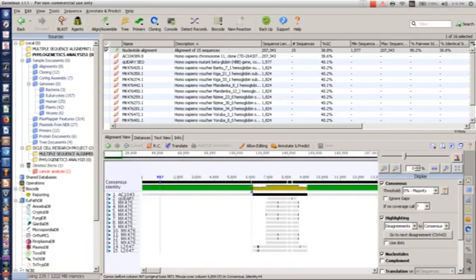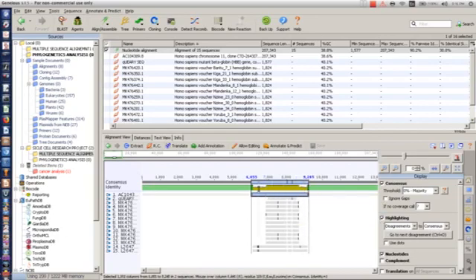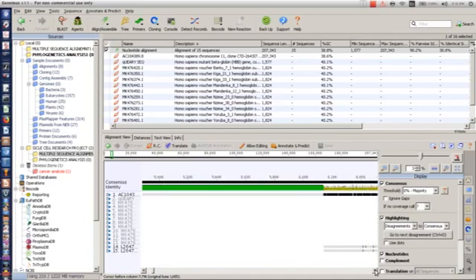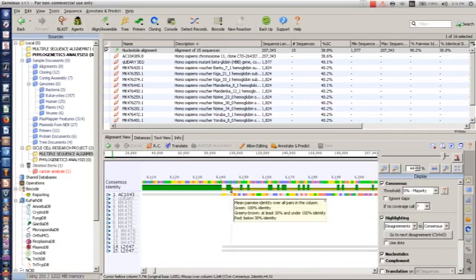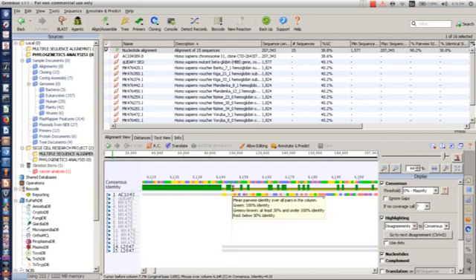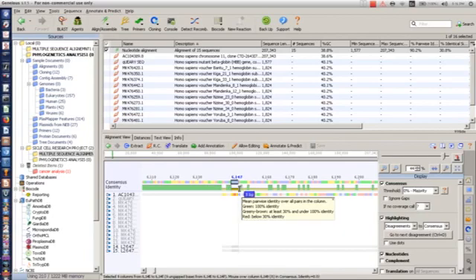But this is actually our region of interest, as you can see. Just this place, this is where I like it. So all you need to do is zoom, so we understand what we are really working on. As you can see, we have some little green lines, I'm talking about the consensus now. You zoom in, and as you can see here, this shows a huge range of differences amongst all the nucleotide sequences. Each of these nucleotide sequences has a line, a line here, a line here, up to the last two. This is just to make us understand the consensus sequence: the whole of this region from here to here has differences. Every one of the sequences has huge differences from here to this place, but from here to here all of them have the same sequence.